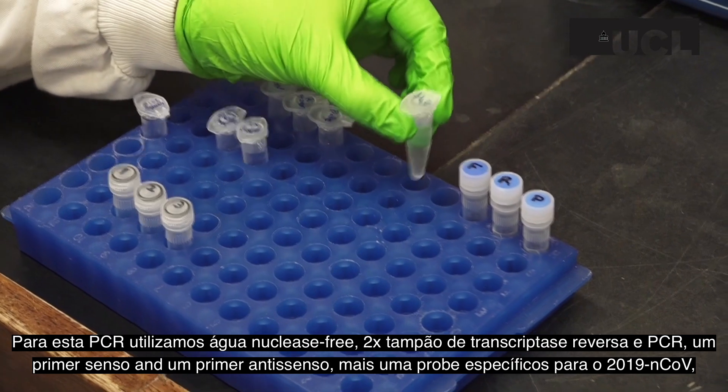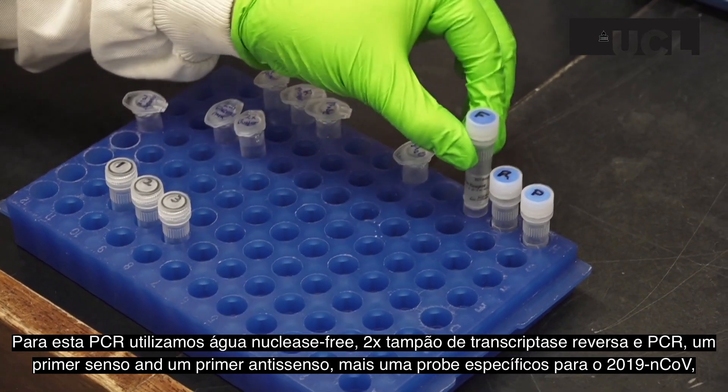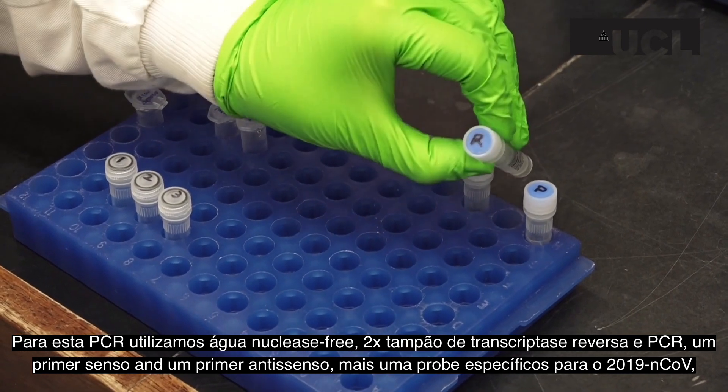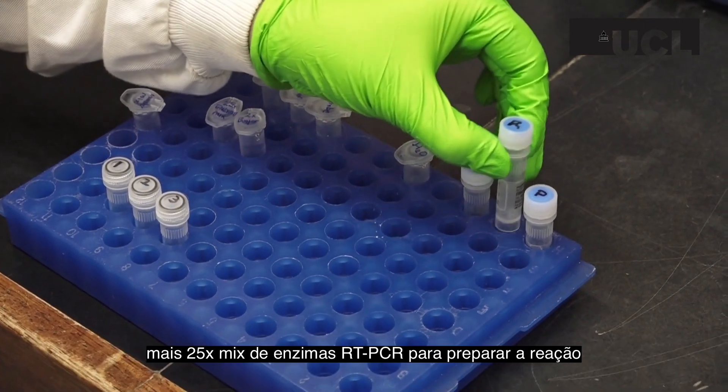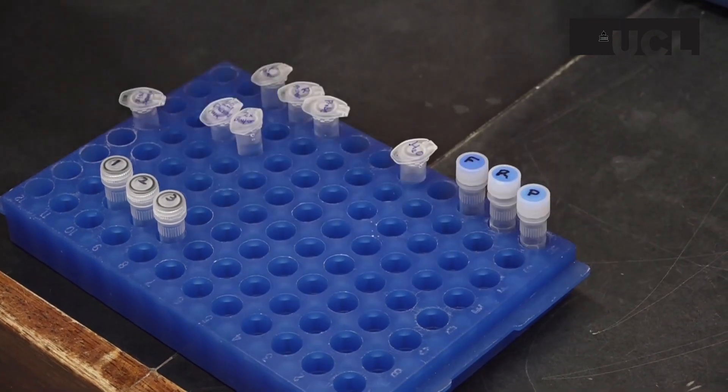For this PCR, we need nuclease-free water, 2x reverse transcriptase PCR buffer, a forward and reverse primer, plus probe for 2019 nCoV, and a 25x RT-PCR enzyme mix to create a master mix.